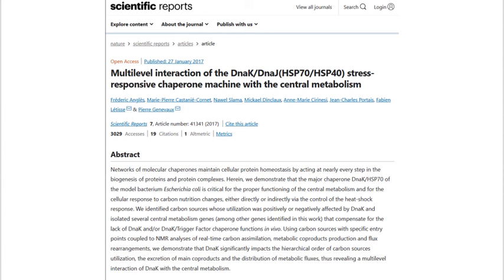Further evidence for me was the 5-fold decrease of HOLA in the treatment samples, which is a key enzyme in bacterial DNA replication, showing suppression of replication mechanisms. Because beta-lactam antibiotics inhibit the cross-linking of peptidoglycan, the increase in abundance of RLPA, which is involved in peptidoglycan binding and maintenance of rod structure, was proposed to be an attempt for the treatment E. coli to utilize a differing pathway for peptidoglycan linking away from transpeptidases. RLPA is also involved in recycling of peptidoglycan monomers.